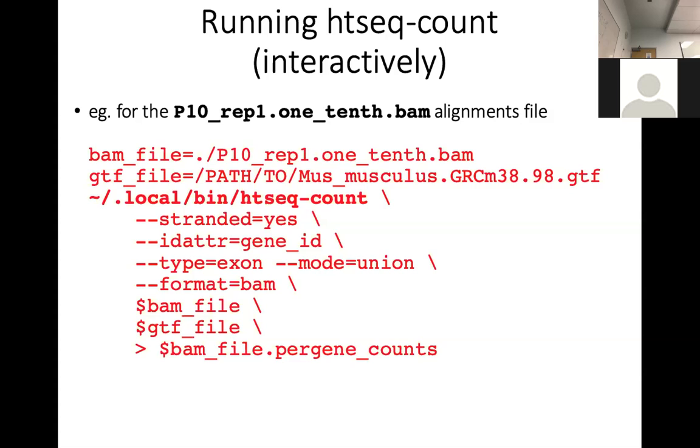Basically, STAR is using gzip to read your file. Then gzip is saying this file does not exist. Okay, and STAR is still waiting for gzip to give it data without realizing that gzip has crashed. Really, STAR should realize that, but it does not. So whenever you see errors in your log files, you should be concerned that something went wrong.